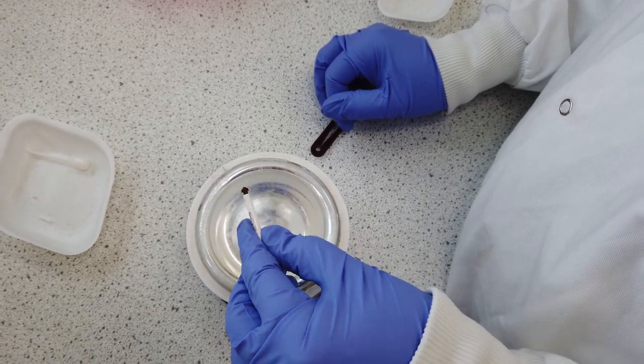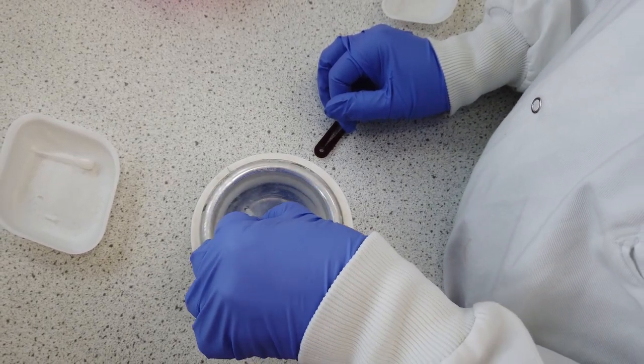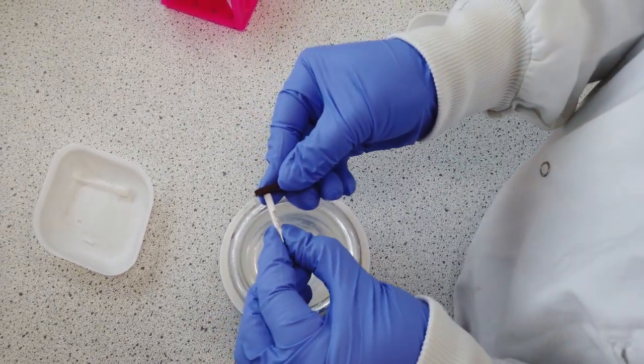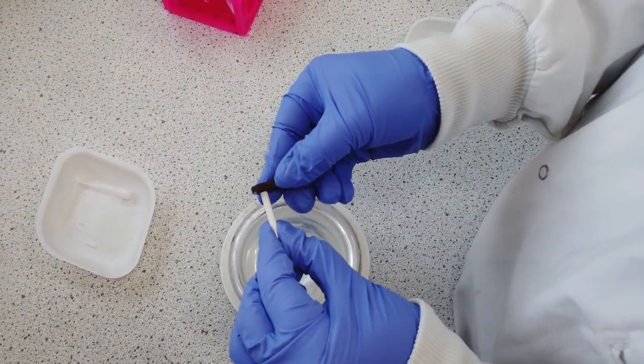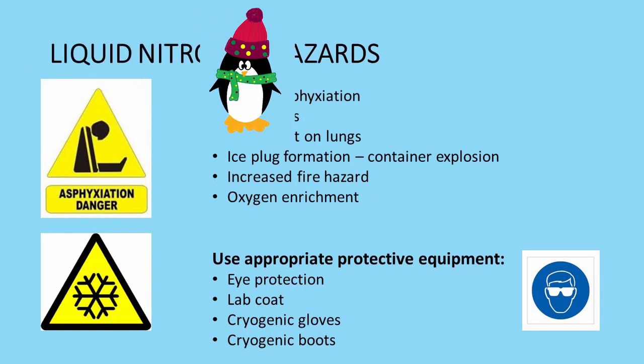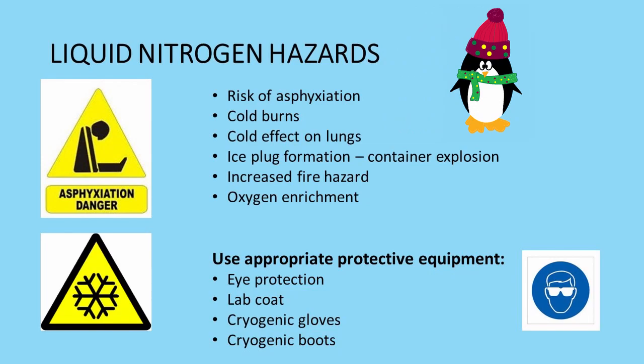If you struggle to insert the drive tip into the sleeve, you can also use liquid nitrogen to carefully dip the drive tip and the sleeve. The low temperature of the nitrogen will make the cap ever so slightly smaller so that it can fit inside the sleeve. Please be aware of the hazards associated with the handling of liquid nitrogen. If you're not a trained user, please seek assistance from someone who is properly trained.